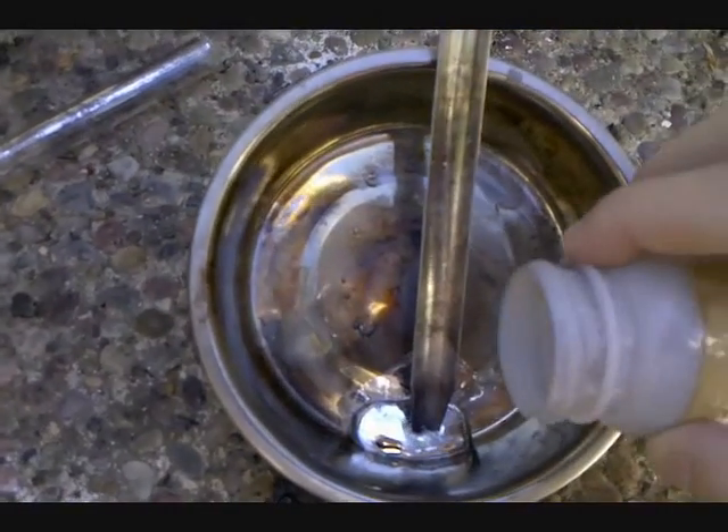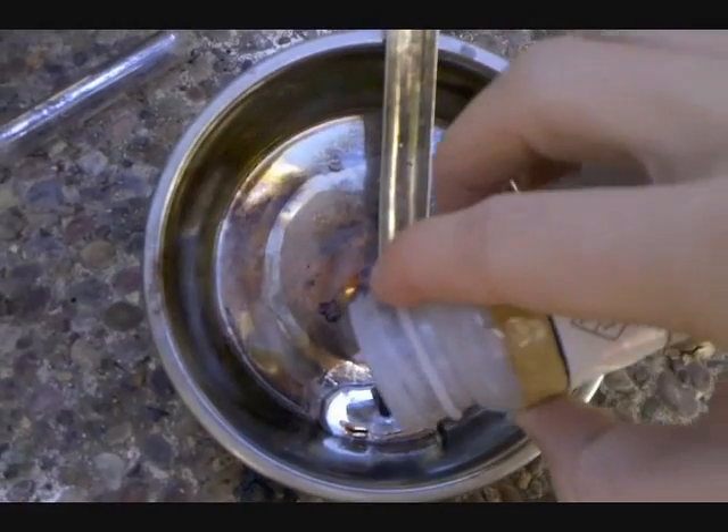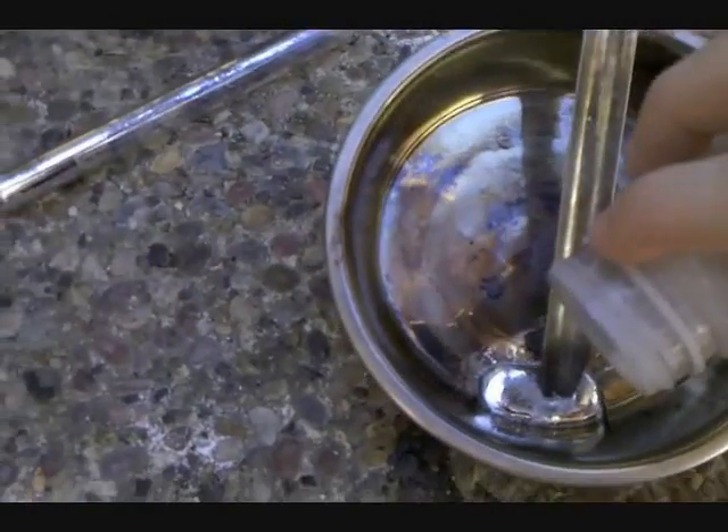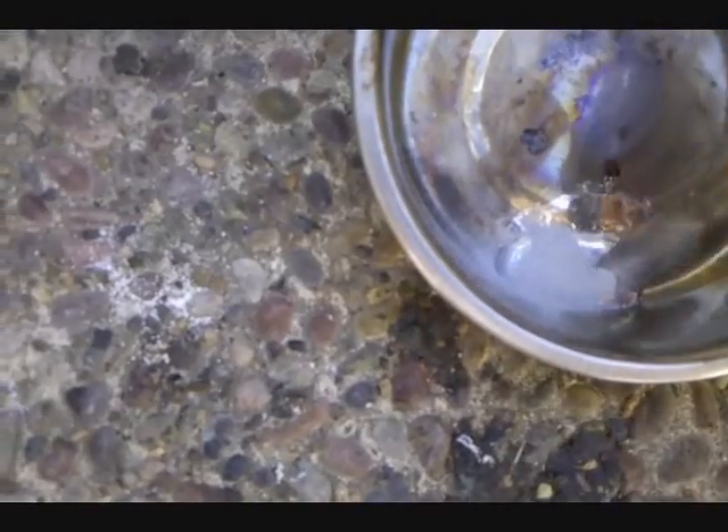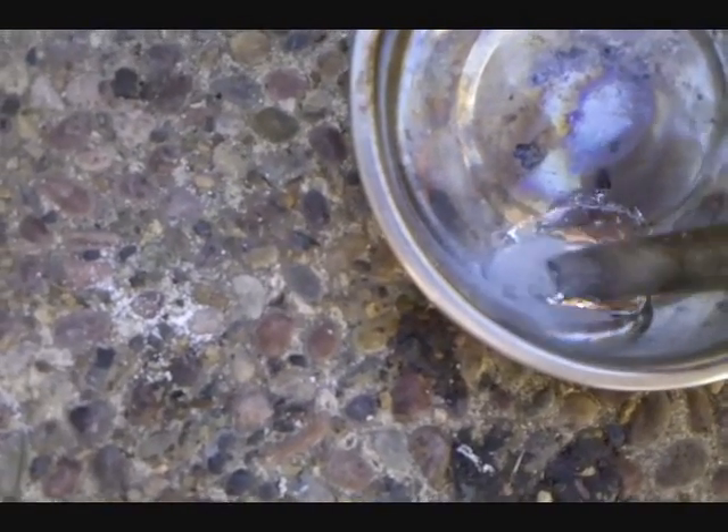So I'm going to add a small amount of aluminum to the gallium, mix it in and heat it up. I'll come back after the alloy has been made.